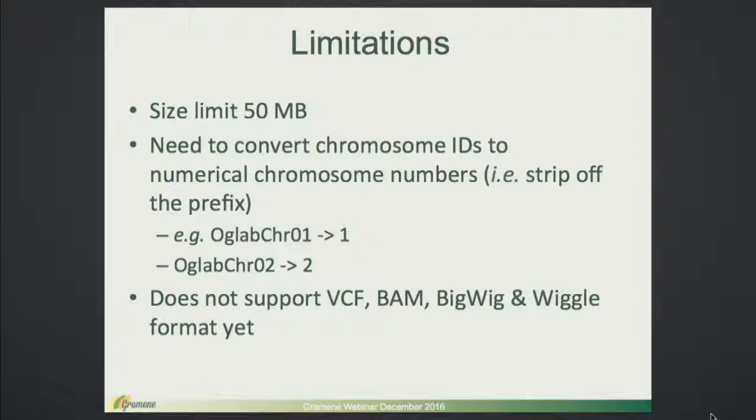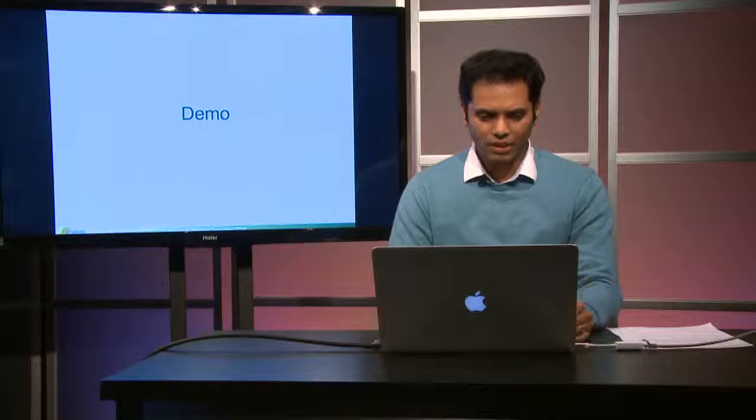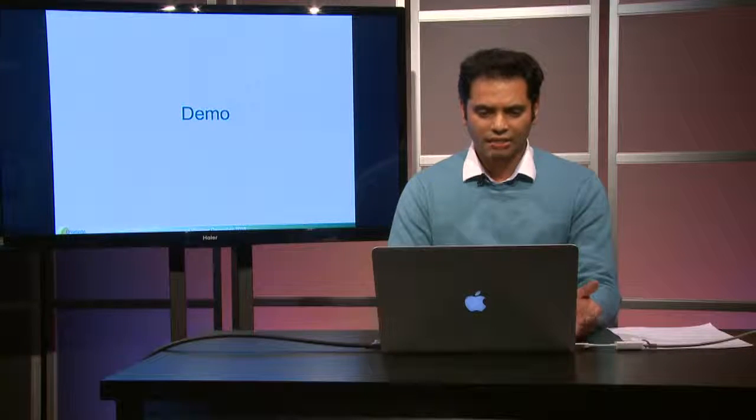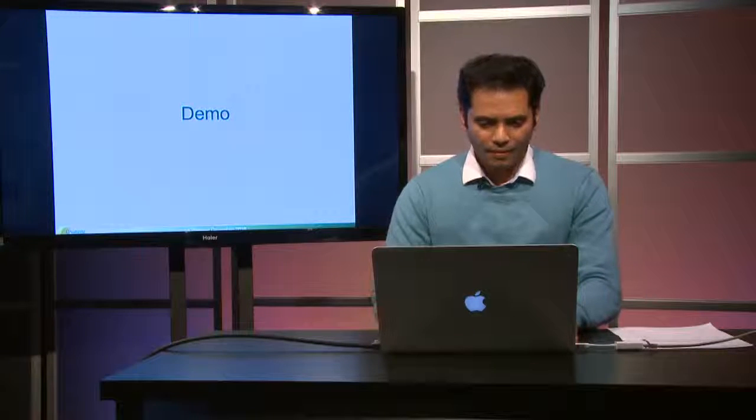Currently the assembly converter tool doesn't support VCF, BAM, bigWig formats yet. That's another thing that will be available in future releases. With that, I'll switch over to a demo. I'll describe how you can run an analysis using a GFF input and a BED input.